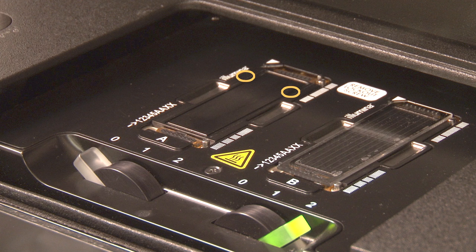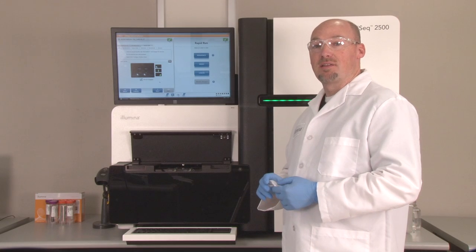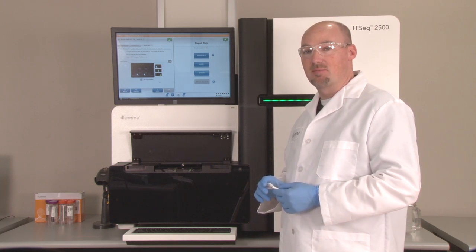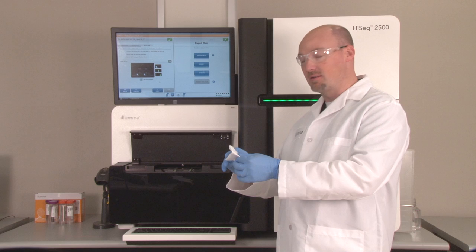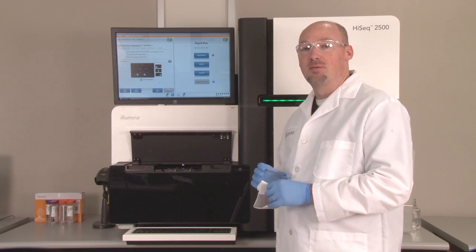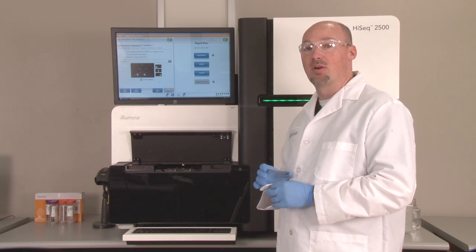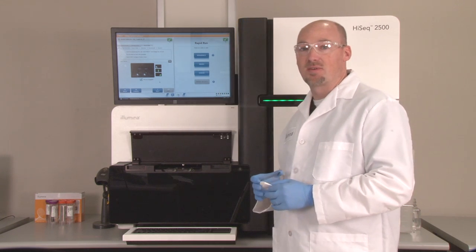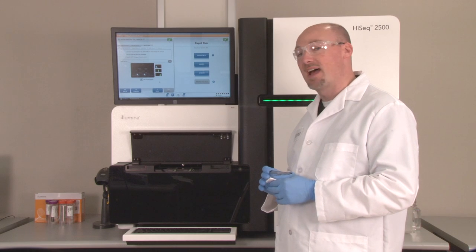Any debris in the ridges or vacuum holes can prevent the flow cell from being firmly held to the stage for the entire sequencing process. Now that the flow cell stage is clean, you are ready to load your flow cell. Follow the standard cleaning procedure with water and ethanol. Also, verify that there is no debris or adhesive substance on the flow cell itself that can transfer to the stage and prevent the flow cell from sitting flat.